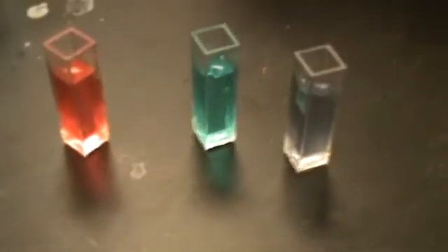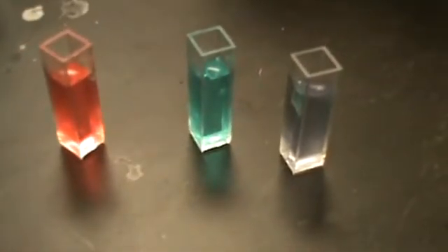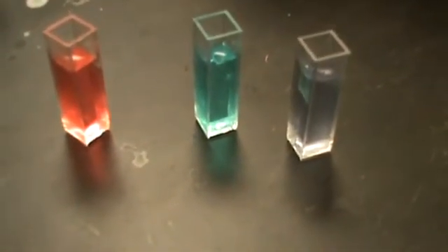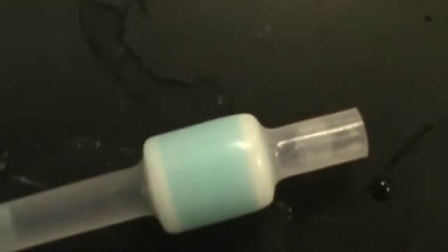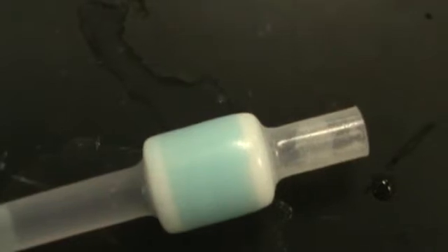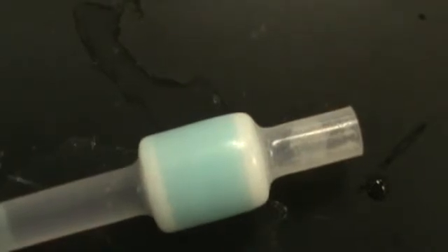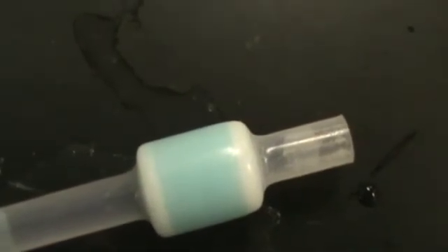This gives us a chance to introduce how a spectrophotometer works and a little bit of how chromatography works. We can get into much higher detail about how we can separate this a lot better, based on what type of solvents we could use, the size of this, and other features like that.